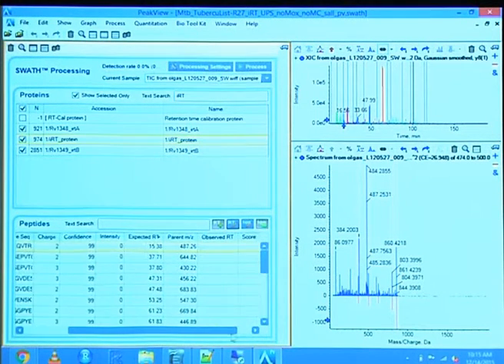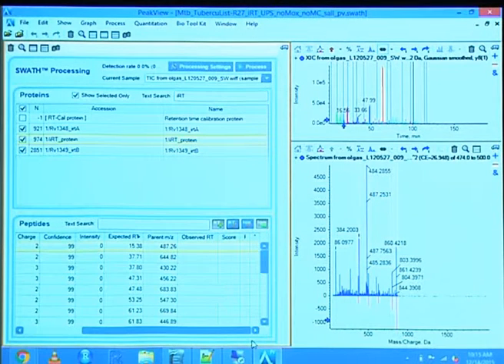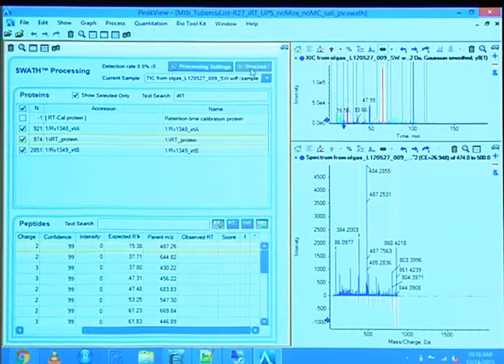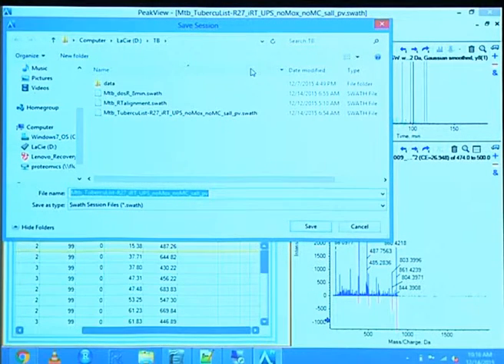These fields here are then filled out once you do the extraction. In order to start an extraction, I usually check again if the settings are right. And then I would extract that. I haven't done it here, but trust me, right now it just uses the library as a name. That's a bad idea, because you're going to use that library for some other extraction or do it slightly different, and in the end you don't remember which one is which.